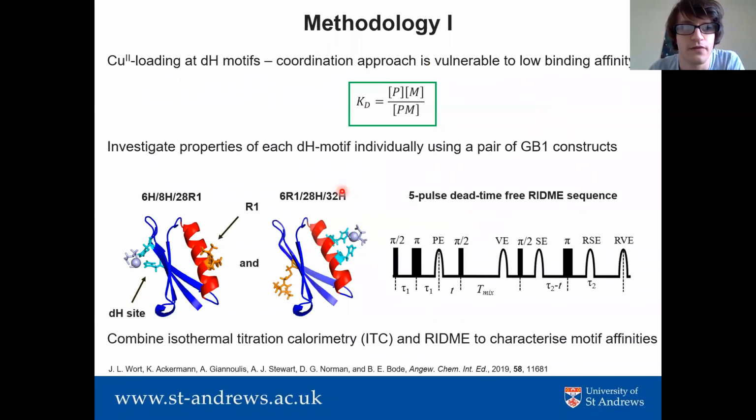So because the spin labeling strategy is a coordination-based approach, it does mean that it's potentially vulnerable to low binding affinity. Certainly the initial studies reported binding affinities in the low millimolar concentration regime.